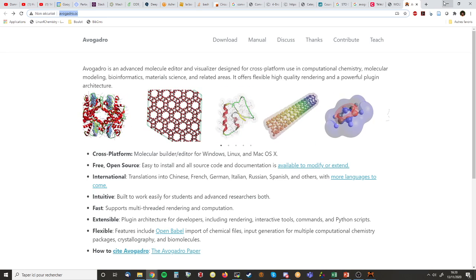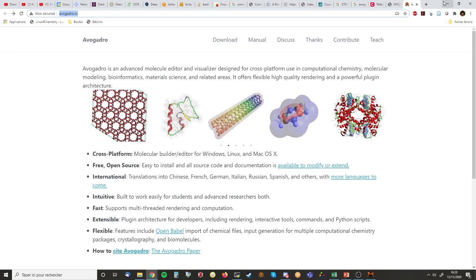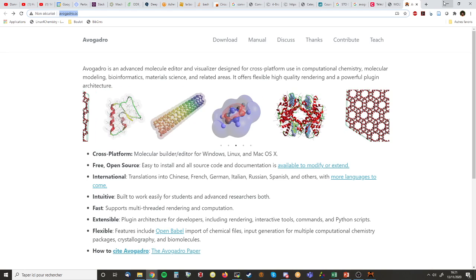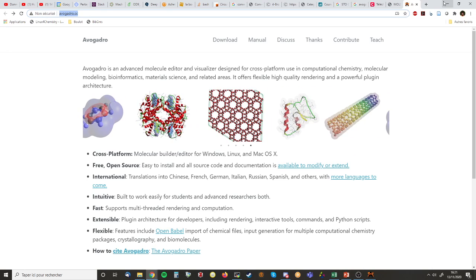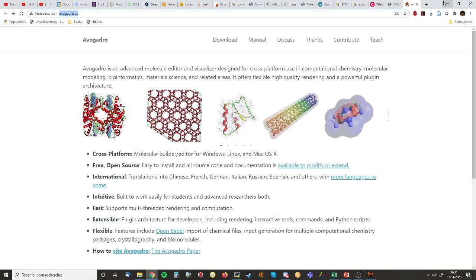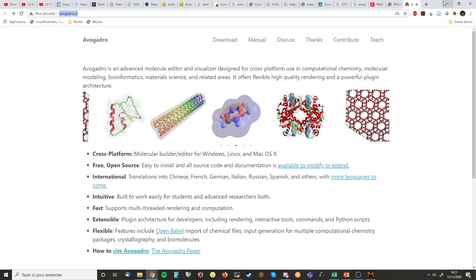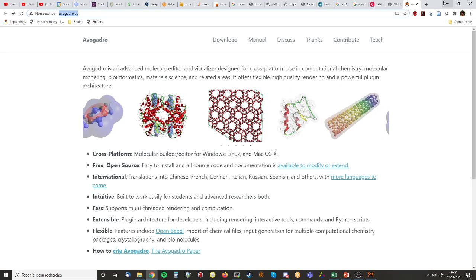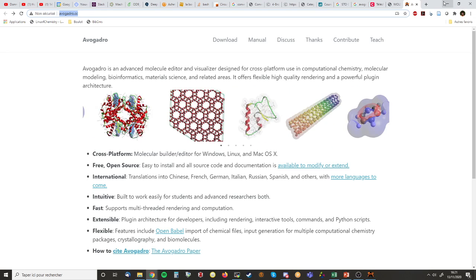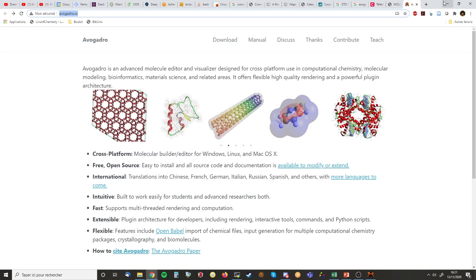No, just when you have your raw information, maybe you have half molecules, depending on the position of your molecule. If you are on a symmetry element, you may have only half a molecule that is crystallographically independent. So when you open some raw data with Diamond, you don't always have the bondings, and you don't have all the atoms. So you need to reconstruct a molecular approach, and for this you need a full resolution of your crystallographic data.